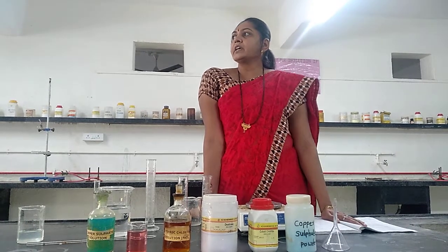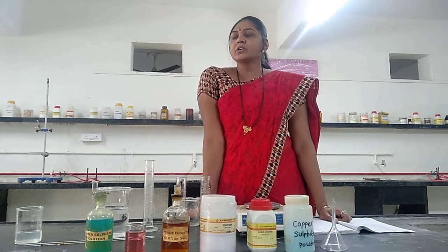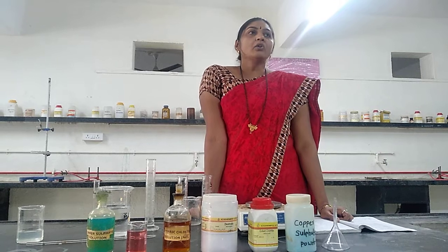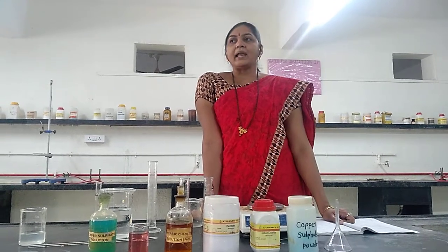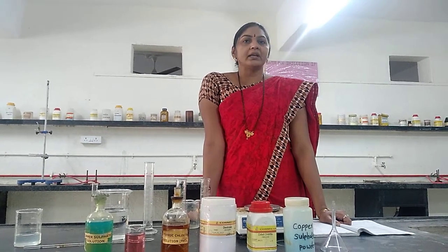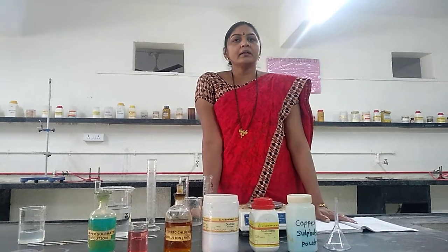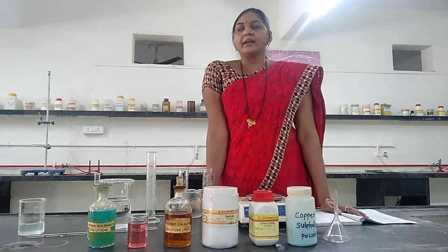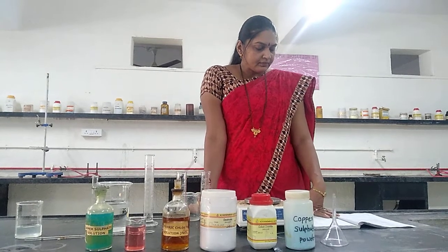When dextrose monohydrate is used and autoclaving is carried out, due to the caramelization of dextrose, it will give some brownish coloration. That's why dextrose monohydrate is not suitable. So, dextrose anhydrous is used in parenteral preparation.